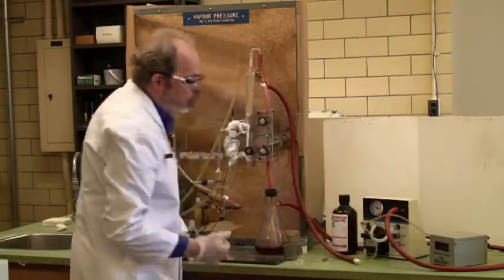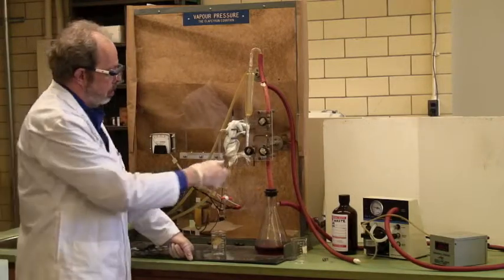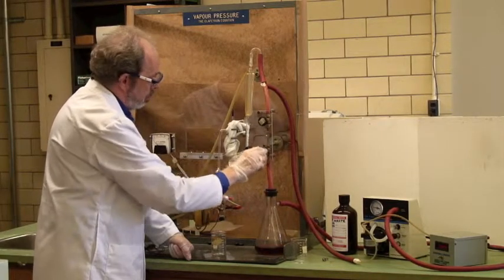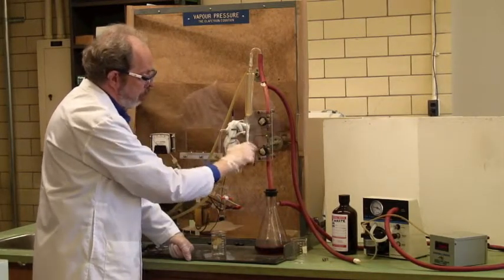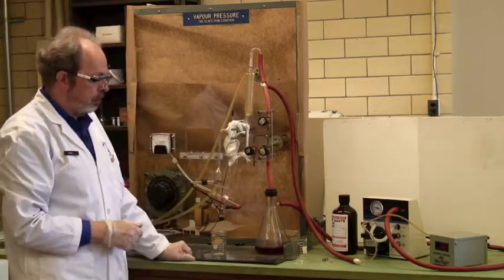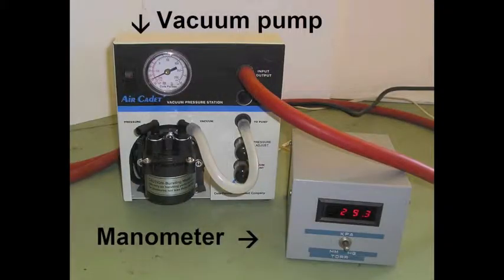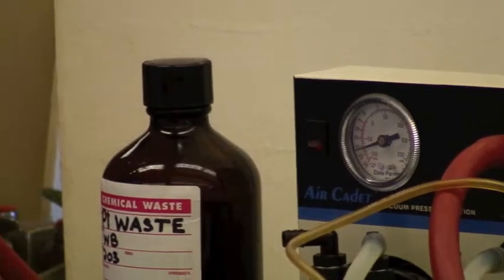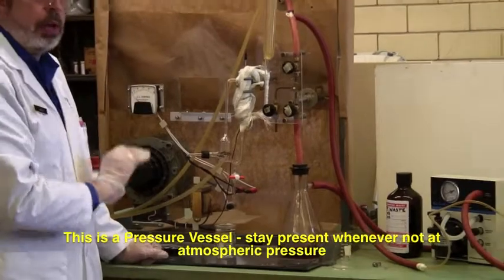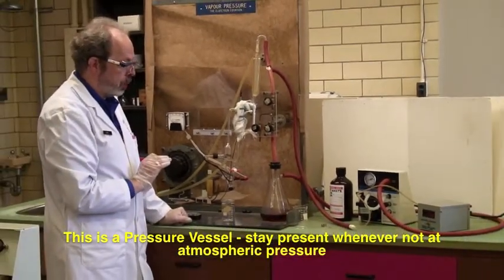When I've got the manometer on, and open this to the system, and close the reserve valve, you'll notice the pressure is dropping 64, 55, and the pressure inside the system is dropping. Now, this is a pressure vessel, so whenever you have got something other than atmospheric pressure in this apparatus, you need to be present. You can't walk away from it when it is under reduced pressure.